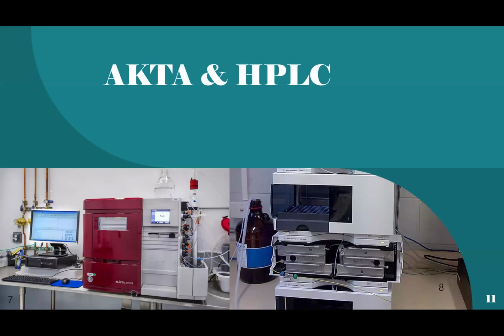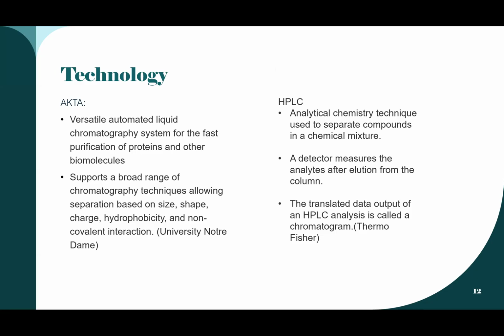So this is also a slide that's dedicated to just showing you all the equipment that is used within industry. The red equipment is called an ÄKTA, and then on your right, we have an HPLC system, and we're going to talk about what exactly that is. The ÄKTA is a versatile automated liquid chromatography system.